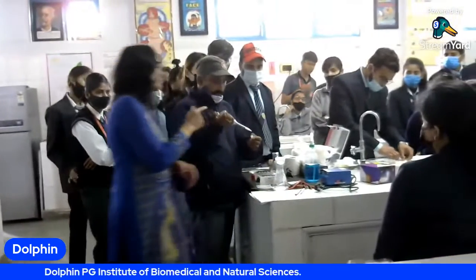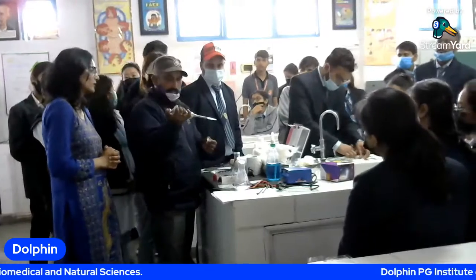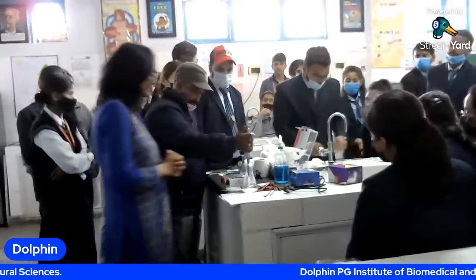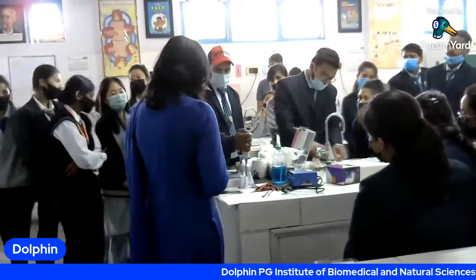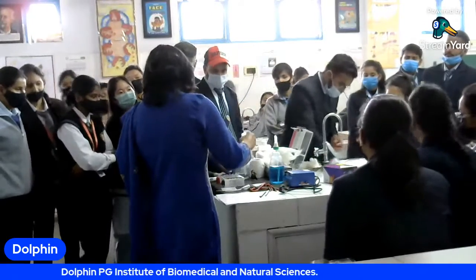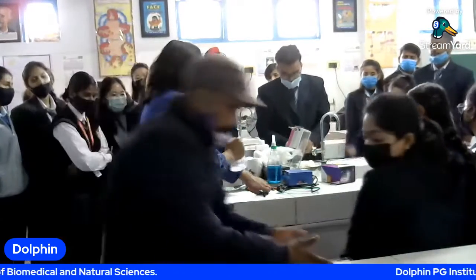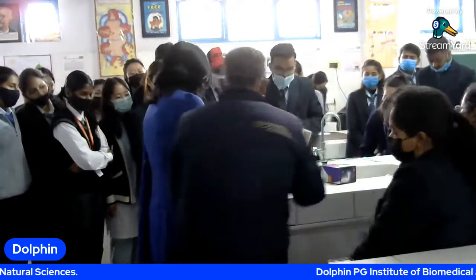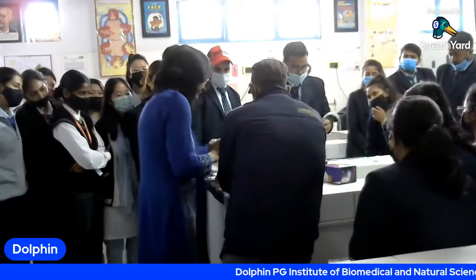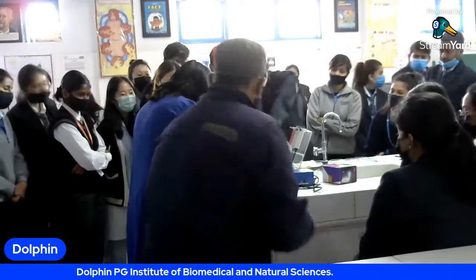This is the micropipette which we are using, 100 to 1000 microliter. Who wants to add? Come one by one.